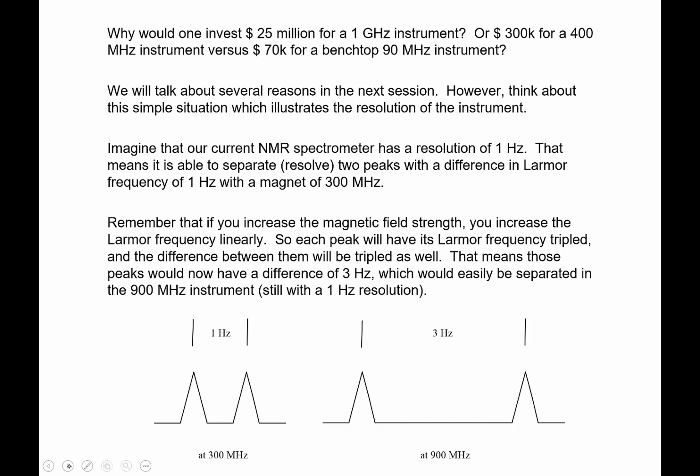Number one, that instrument's going to be used by all of you, because everybody's going to pay for it. And I'm only going to be looking at biomolecules. And I'm going to look at drug discovery, all of that. And so there is a need for those high field instruments and that resolution, and the area is bio.